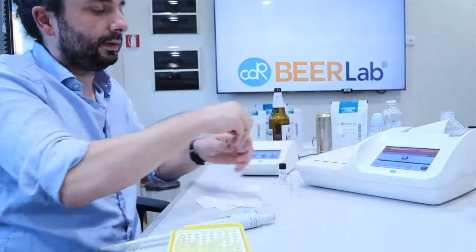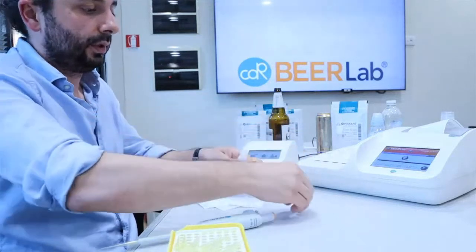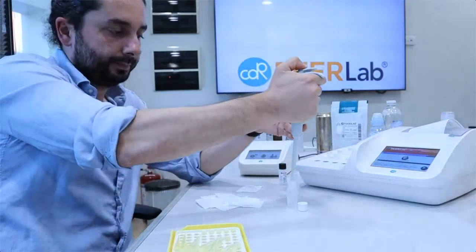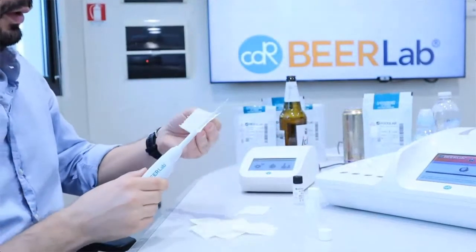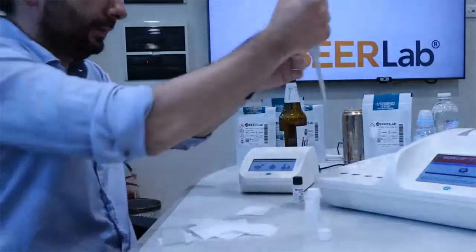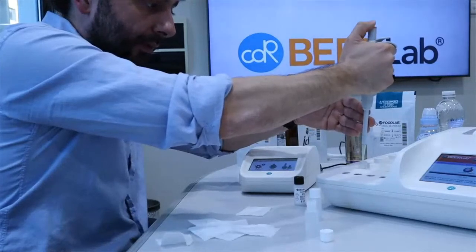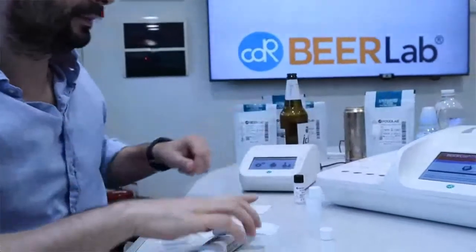have to add the diluted sample. So we have already prepared the diluted sample. So in the same way, the same 100 microliters, we collect the sample. Again, here we wipe the tip like this, and that's it. We put into the liquid the tip, and we release the sample inside the cuvettes. This is the most difficult operation of the analysis.